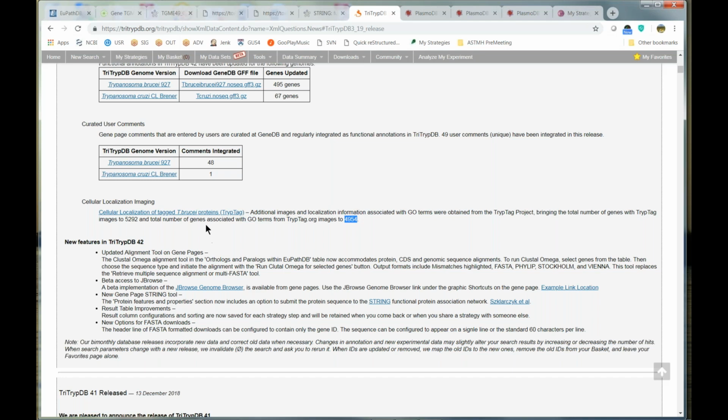Do we want to stop here, or should we look at the cellular localization imaging? We have 4 minutes left. I think maybe. Let's ask for questions. Yeah, we should stop here, and I'll quickly highlight HostDB. And oh yeah, great. Yeah, forgot about that. Yeah, and then there's a question to answer. I might show something as well. Okay.